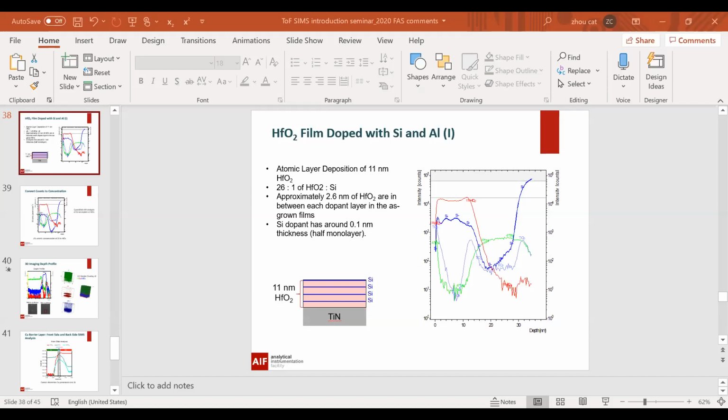The only downside to that would be if, when you covered it with your molecule, you're hiding some of the surface. So the thing you're assuming to be constant isn't necessarily. Yeah, that's true. So you kind of overestimate the result, because your matrix ion is buried and the ratio will be much higher than it's supposed to be.